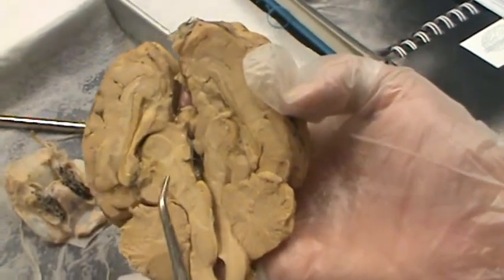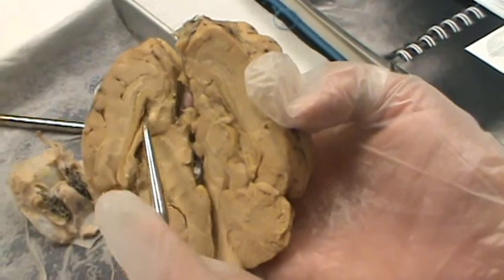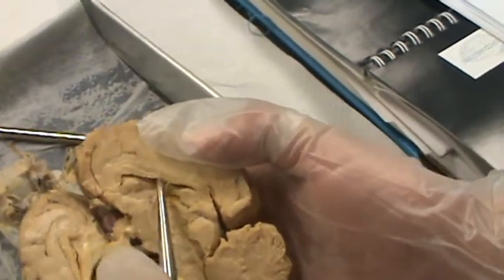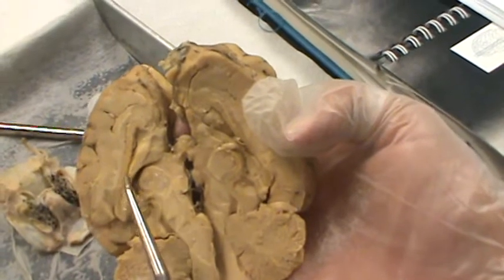It looks like a hearing aid. It's just the top part of it. The lateral ventricle is going to be inside the corpus callosum, which is this area. Lateral ventricle. You can kind of see it in here. Lateral ventricle.